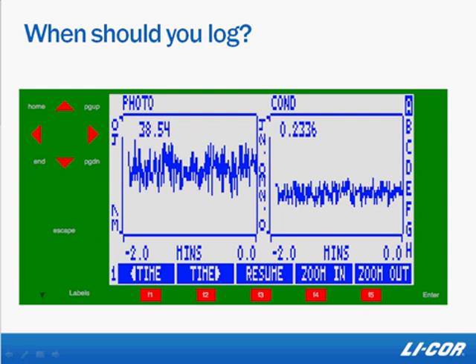You can also look at stability criteria and total CV on line E of new measurements mode, but remember that the instrument's stability criteria are only as good as you make them.